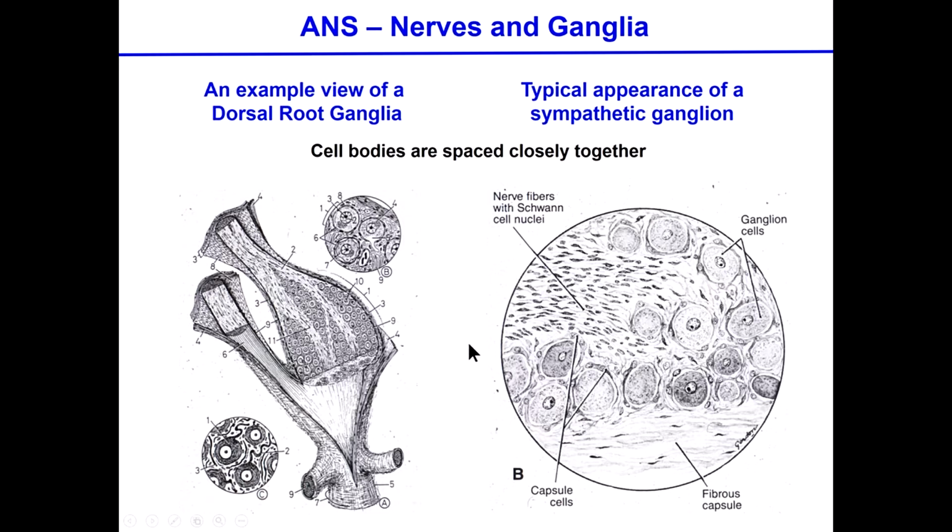Here in the ganglia you see all these bodies of the neuron. This is a typical region in which you find primarily the bodies of the nerves. A number of nerves converge in that particular place, and if you were to do sections in different positions, you will find these kinds of structures, typically with the nucleus located in a central position.